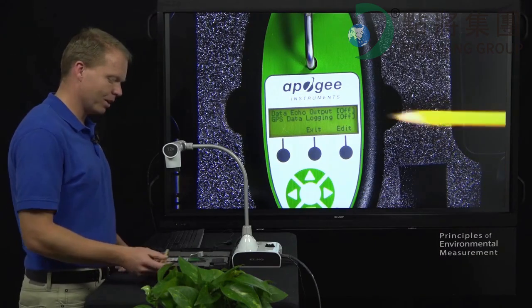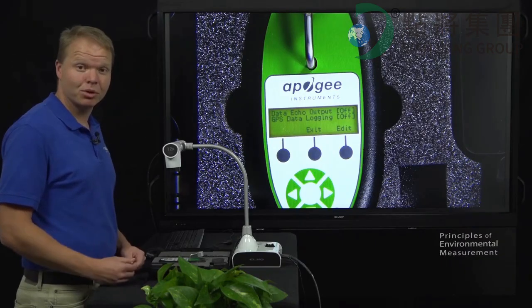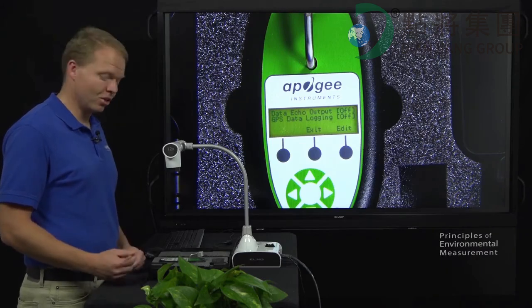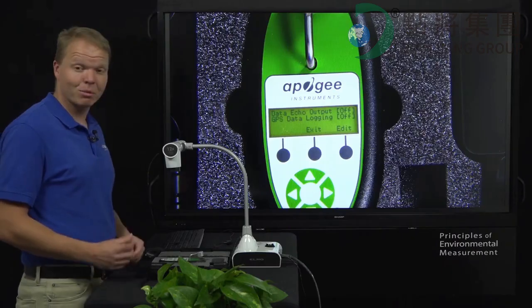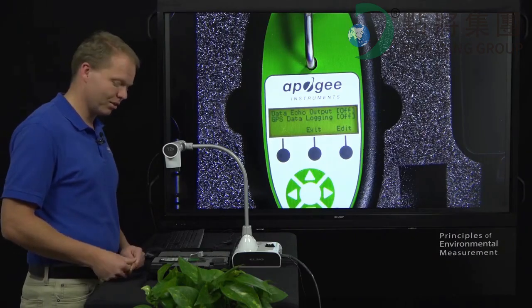And then same on the second one, the GPS data logging, you would also plug into that same 232 port some sort of GPS module, and then you'd click on this menu, and then you'd have that set up. So again, for more details on that, just contact us here, and we'll tell you what we have found that has worked for us.